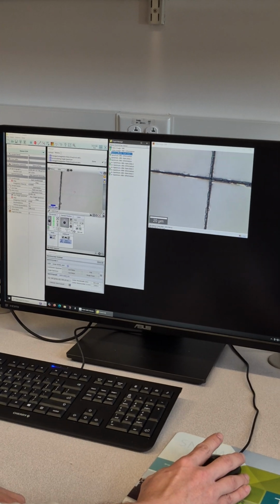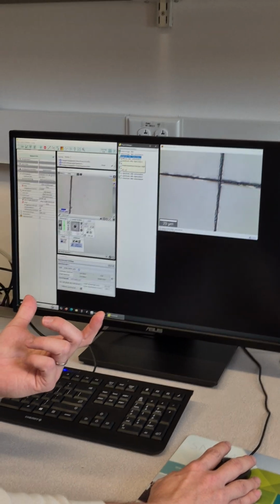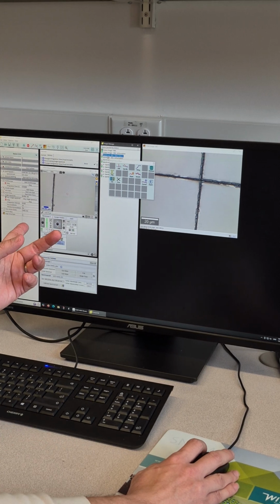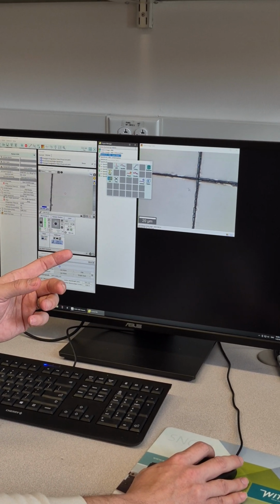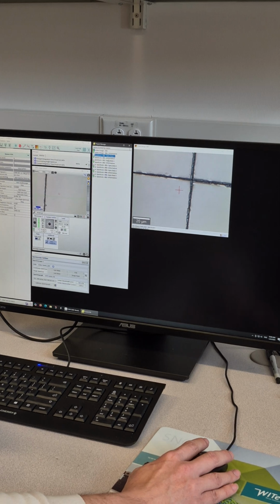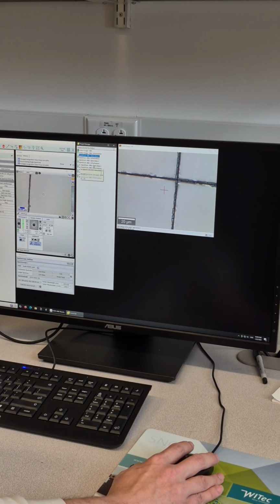So you just find the spectra that you want to show where you collected. You hold the spectra with the left key and you drag it. Forget this window. You just drag it into the image anywhere. And you drop. So now it's at the shown position. This red cross center is where you collected the 1. 2, I didn't move, so it's the same position.